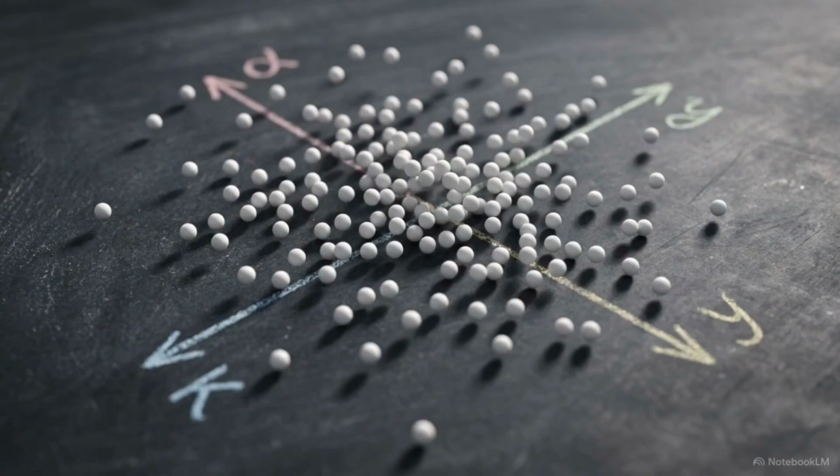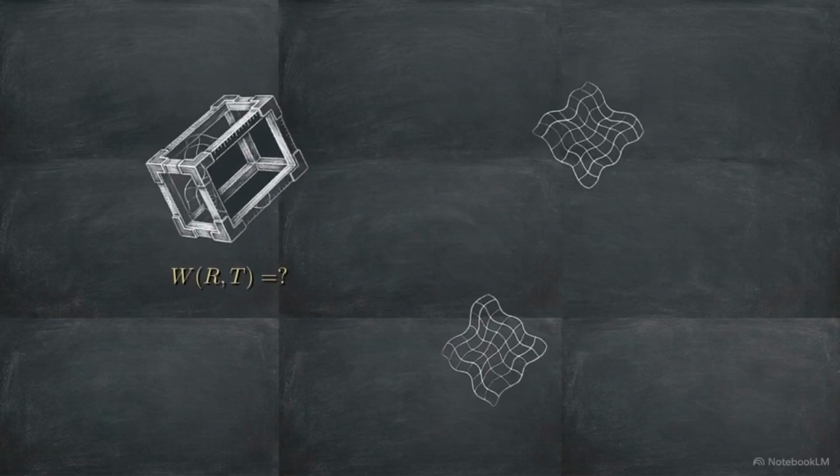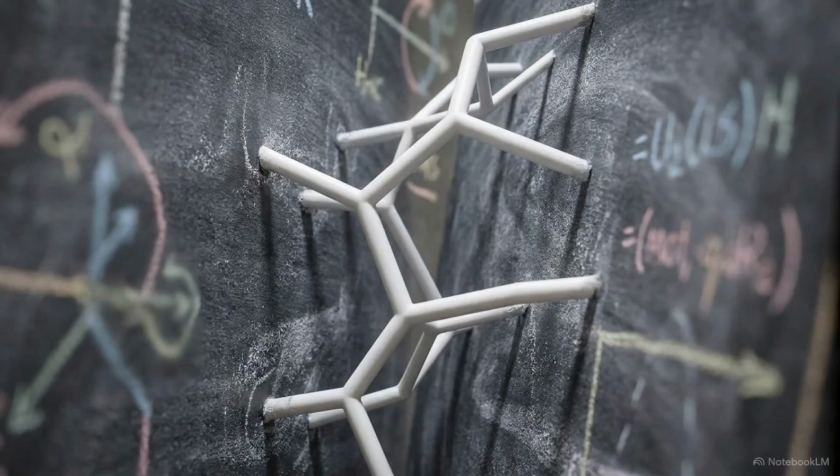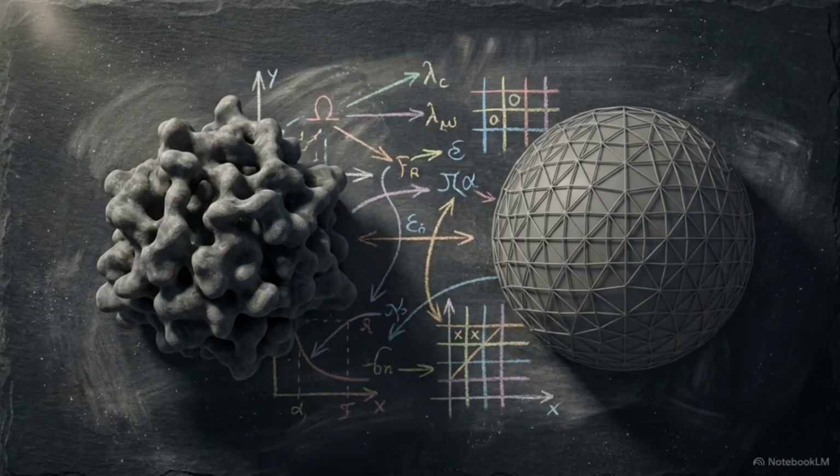The true bottleneck of crystallography lies here. We need to determine a precise spatial transformation matrix to average the maps, but we need it before we possess an atomic model, and before we have the electron density phases necessary to visualize the molecules. We solve this by abstracting the physical protein into pure geometry.